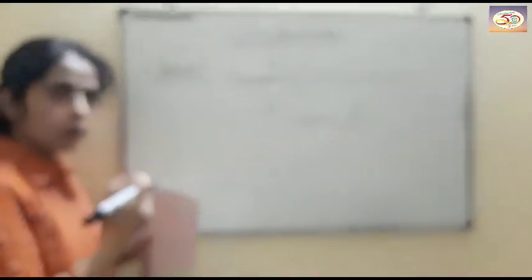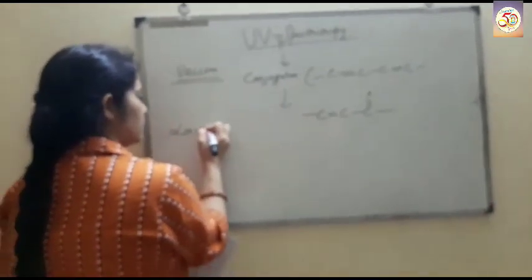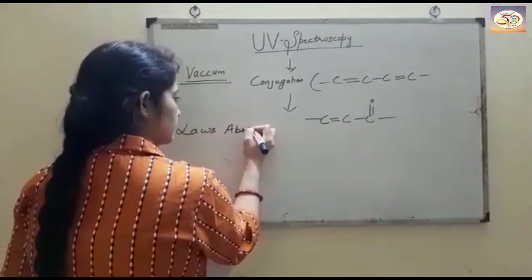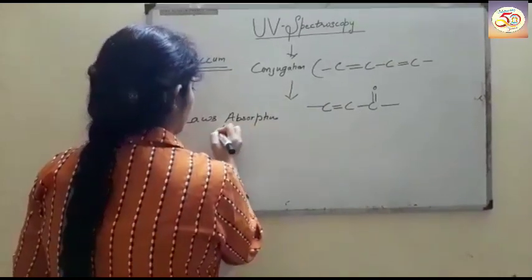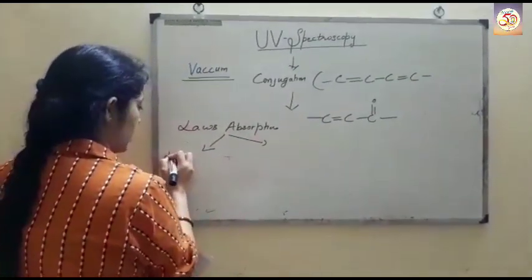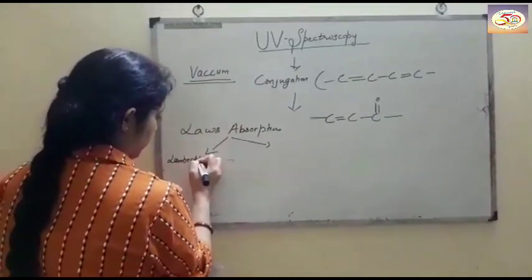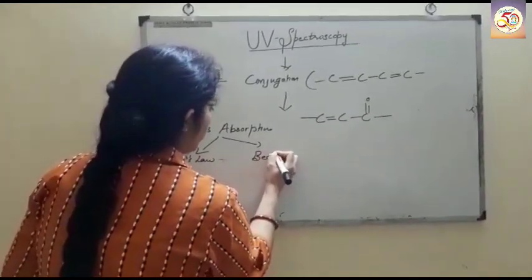To study these compounds, there are two laws used, called laws of absorption. These two laws of absorption are Lambert's law and Beer's law.